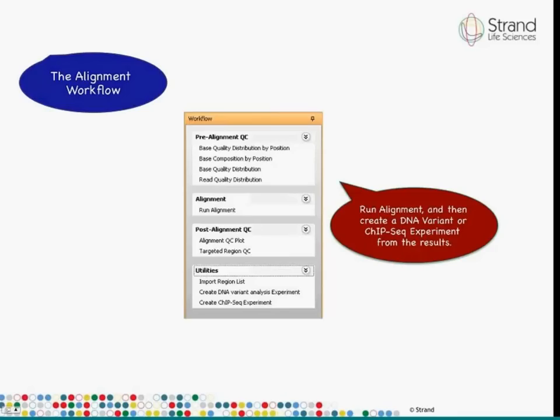Once you're satisfied that the reads are good, you run the alignment workflow step. After alignment, you can view post-alignment results including mapping quality and alignment score plots. For targeted region analysis or target enrichment analysis, there's a new target region QC step that shows coverage, GC content, and other metrics for every targeted region. Once the alignment looks good, you can create either a DNA variant analysis experiment or a ChIP-seq experiment, and proceed with downstream analysis.